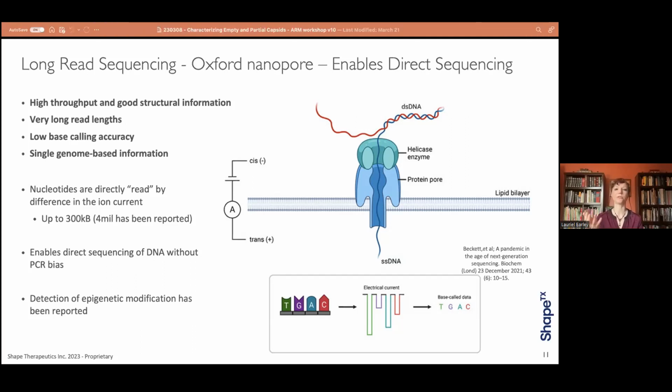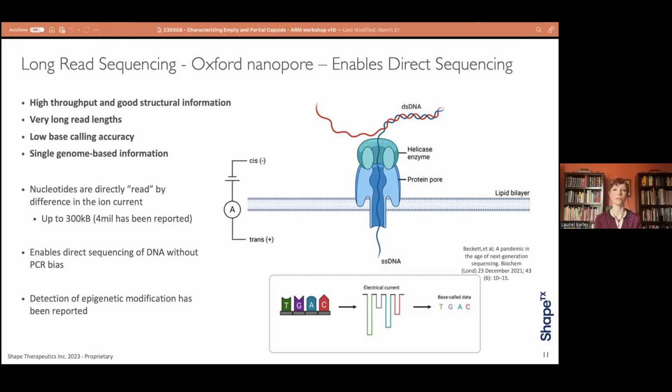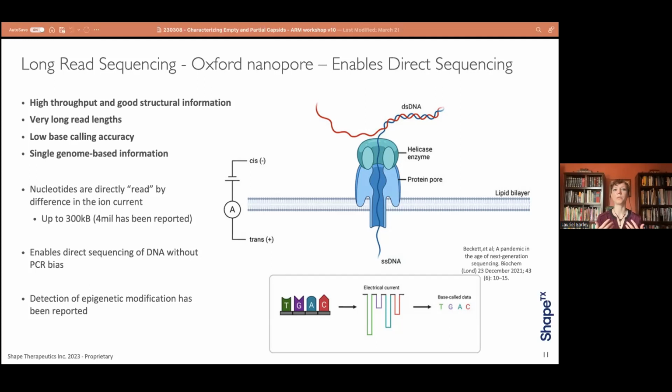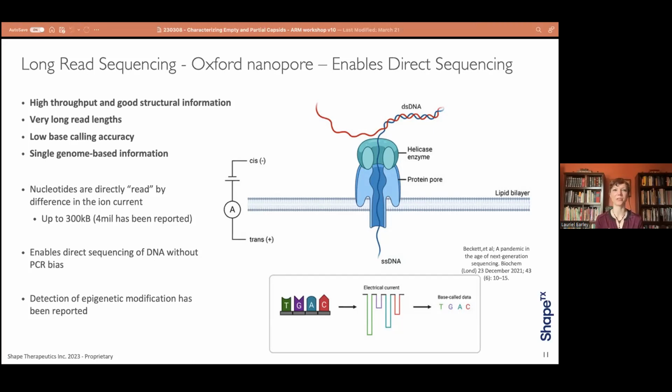And so as the DNA goes through the pore, the electrical current will change, and you can recognize distinct signatures from each nucleotide. So instead of doing the sequencing by synthesis, you're actually directly reading those nucleotides as they go through the pore. You can get really long read lengths for this. It's even been reported that someone was able to make a read length of 4 million bases, far larger than the 5,000 for AAV. So you can certainly do full single molecule sequencing of AAV on the Oxford Nanopore, and that has been published in the literature.